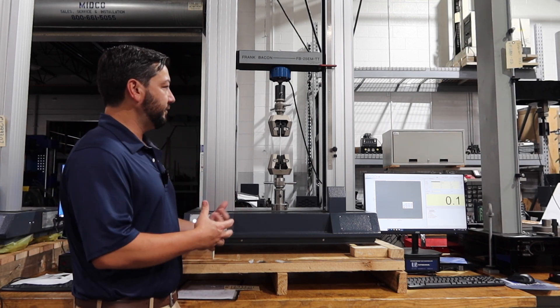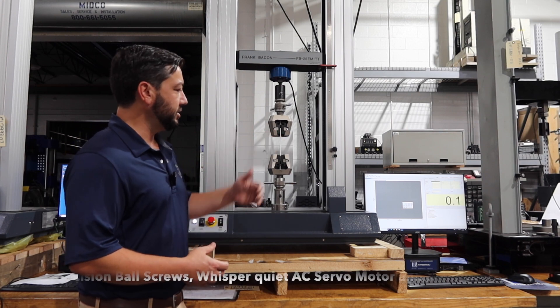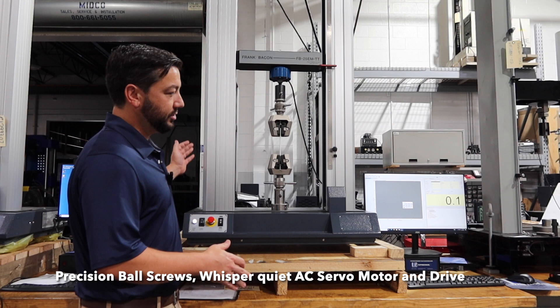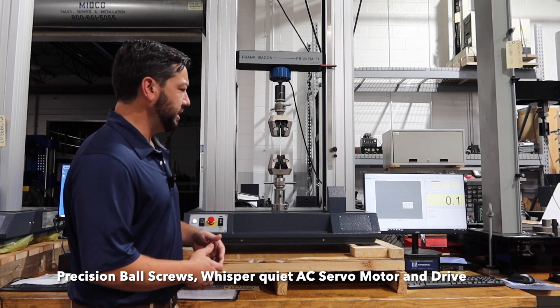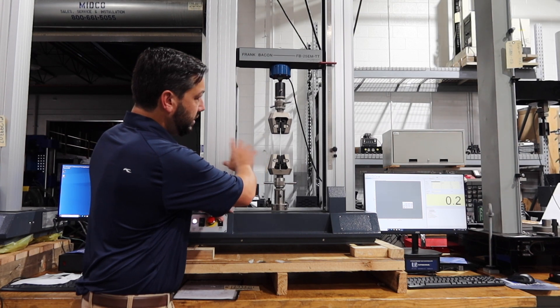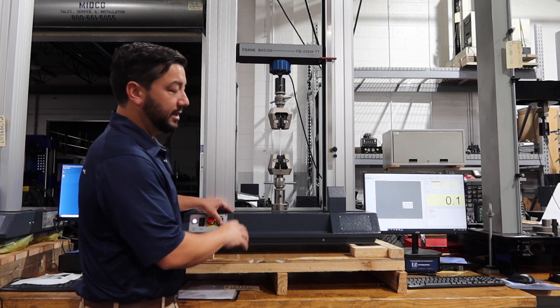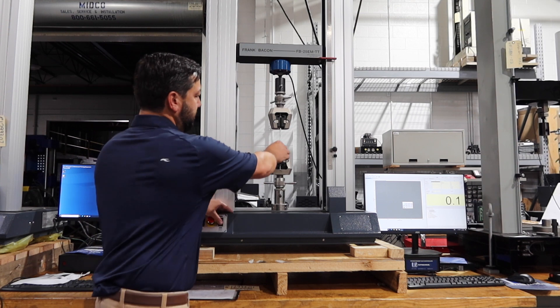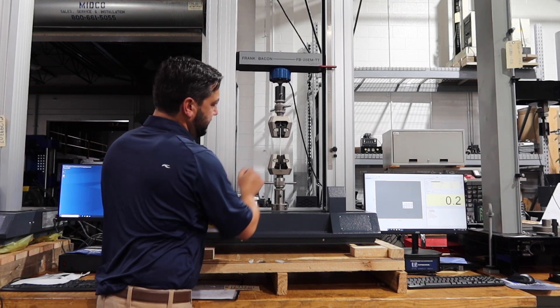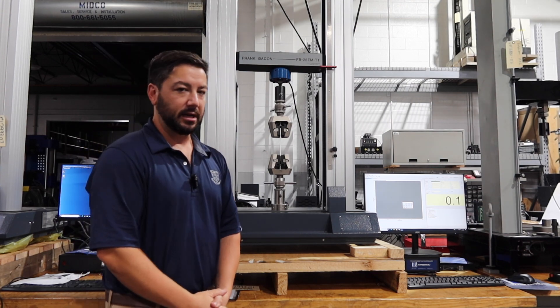We've developed some really nice features here. We've got precision ball screws and a whisper-quiet AC servo motor and drive. So when you're jogging this machine, whether for alignment on a specimen or running your test, you're not worried about anything except how you're setting up and running. It's a great system, very easy to use, and very easy to set up.